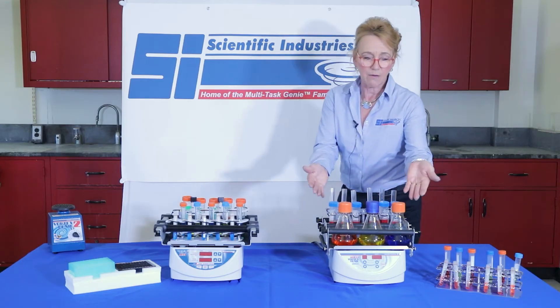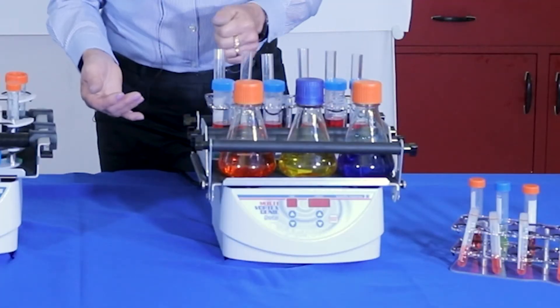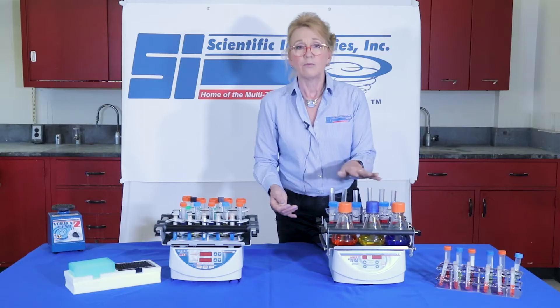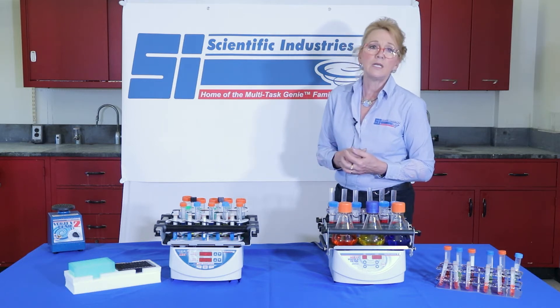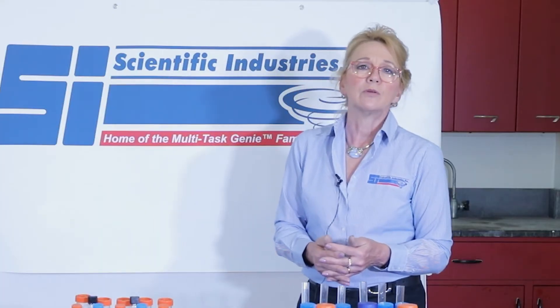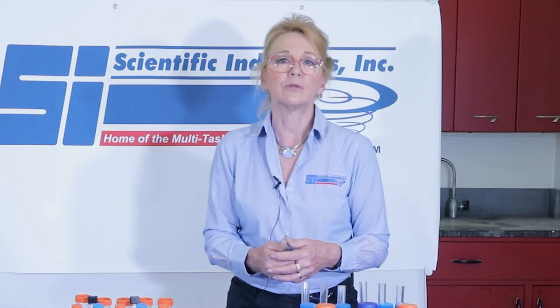Right now I have these set up with flasks and 50 ml tubes and some larger capacity open top tubes. One of the nice things with these Vortex mixers is also the ability to work with open containers. Some of you may be familiar with other vortexing equipment that has a plate that comes down — it does not allow you to work with open containers. With these units, you can work with open containers.